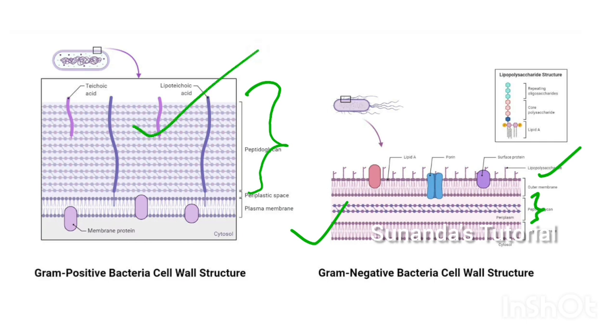But here the gram positive bacterial cell develops a very strong CVI complex, and it cannot retain the counter stain or safranin. So finally it will appear as purple or violet, which is the color of the crystal violet.